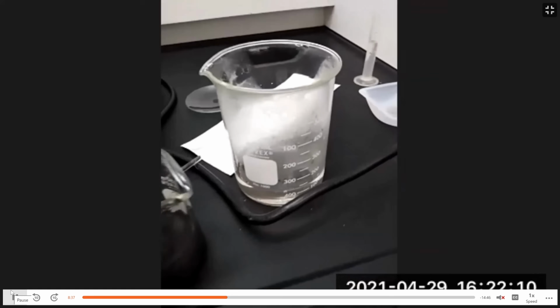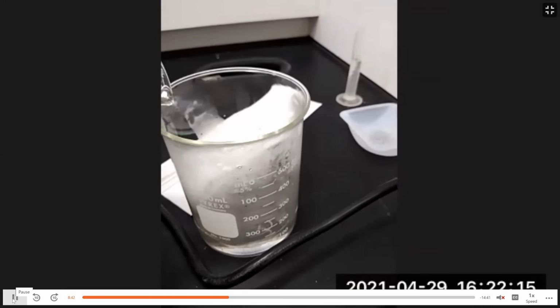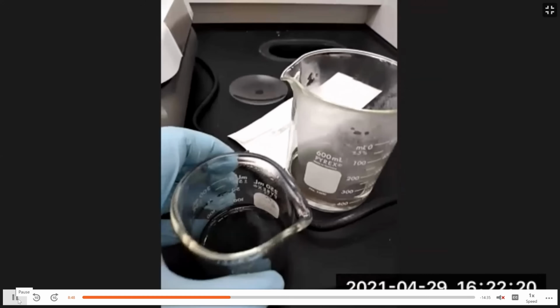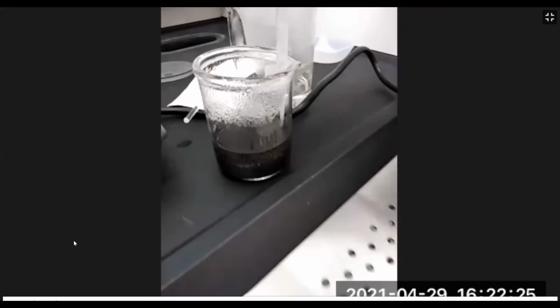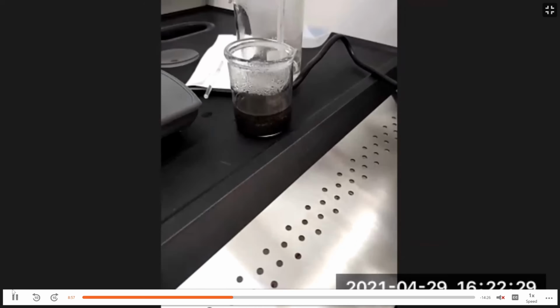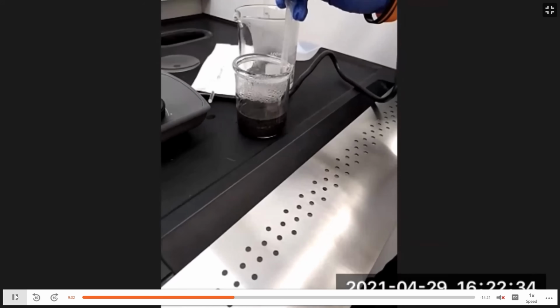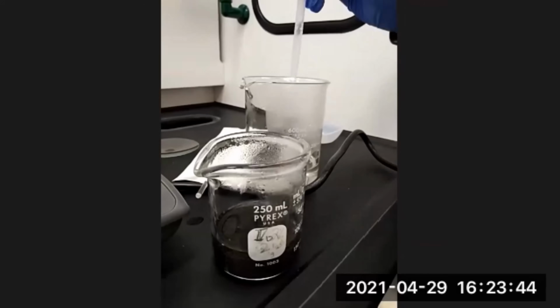So we're going to watch the student decant some of the solution from the beaker. You've got to be careful here not to lose any of your precipitate. So once it gets close to the level of the precipitate, we're going to use a dropper to get out the remaining solution. So try to be very careful here. We don't want to extract or pick up any of the precipitate while we're doing this stage. It's very important that we be very careful here.